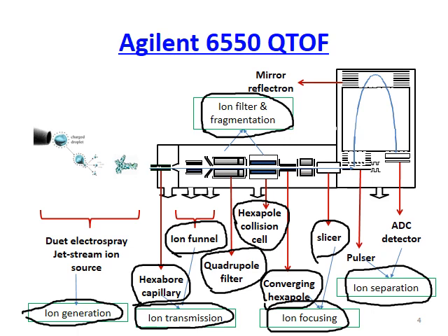The reason is, if the ions start at a different starting point, the subsequent measurement inside the TOF will not be so accurate. So that's why the ion focusing is meant to make sure all the ions start at the same time, at the same energy level.